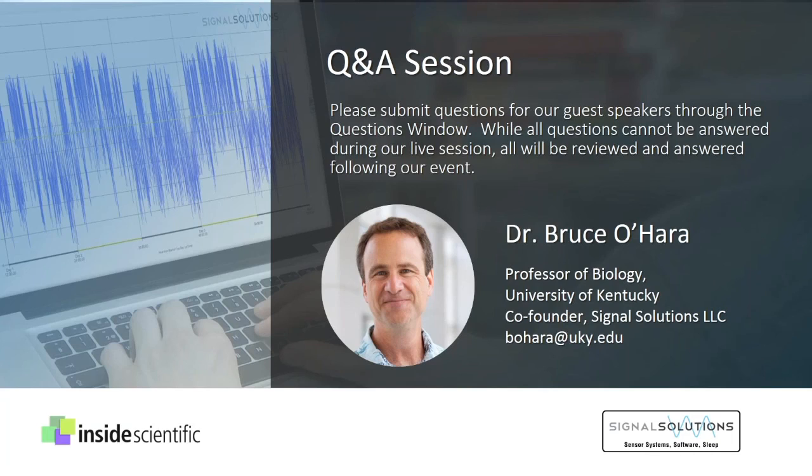So it is a nice way of even just checking on animals. That's why I think it could have long-term usefulness as generalized health monitoring, but also for your particular sleep-wake data and breathing data. All the screens I showed you can be accessed from any computer anywhere, as long as your animal room computer has internet access.